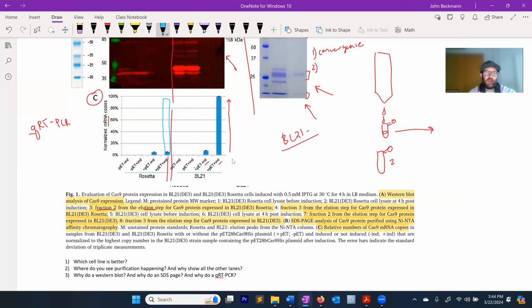Because the pattern is not like that, it tells you it's not the codon bias, codon optimization, or the tRNAs that's the problem. It's actually a problem of transcription, which suggests that maybe you don't have very many cells growing. So they use this to suggest that maybe there's a problem of cellular growth, and then they later go into analysis of cell growth.